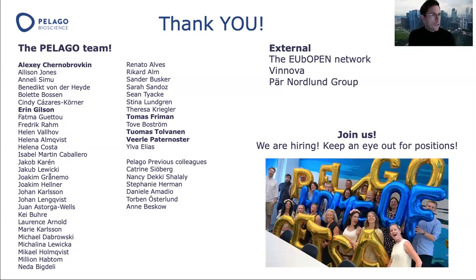I think that we can use it to do similarity searches. For example, when our customers have a compound, they send it to us, we profile it alongside other compounds, and we plot it in one of those t-SNE plots, and you can see more or less if it behaves in a way similar to something else. That could be quite useful. Also, by increasing the size of this atlas, it's the closest thing that we can get to anything near AI, in my opinion. I still think that we would struggle a bit in those kinds of powerful applications, because this is data where there will be variations depending on lots of factors that are not due to the cell line.